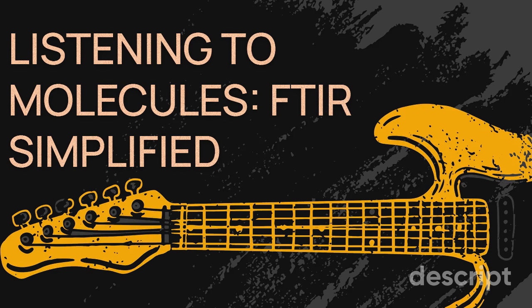I'm also curious about the role of artificial intelligence and machine learning in FTIR data analysis. Right. I imagine these technologies could help us sift through those mountains of data and extract even more meaningful information. You're spot on. AI and machine learning are already making their mark on FTIR. Wow. Helping us automate data analysis, identify patterns, and even predict protein structures. These advancements are paving the way for faster and more efficient protein research.